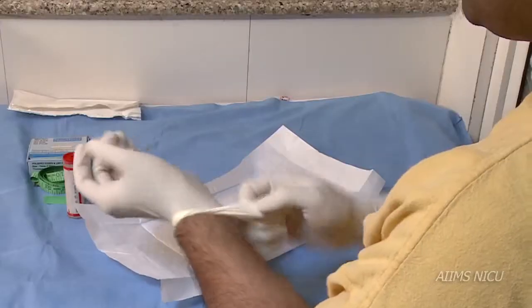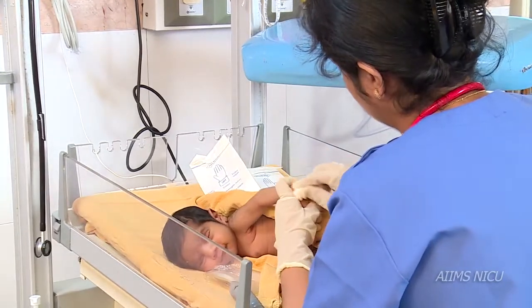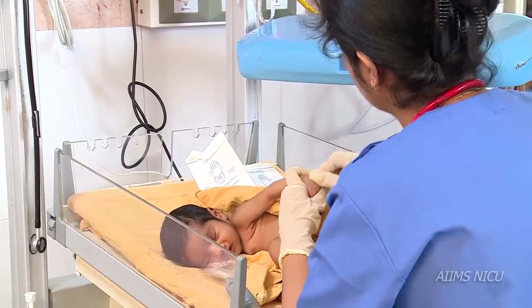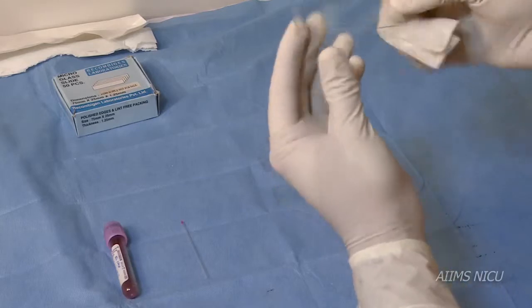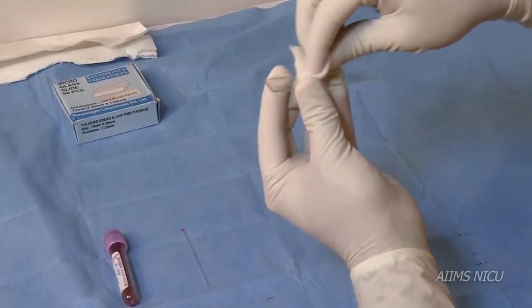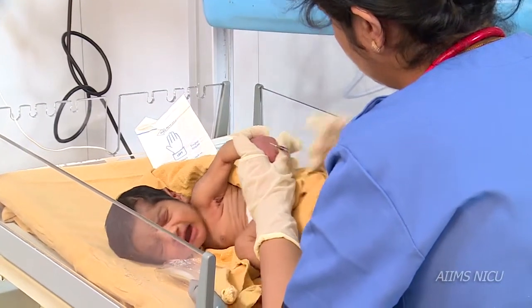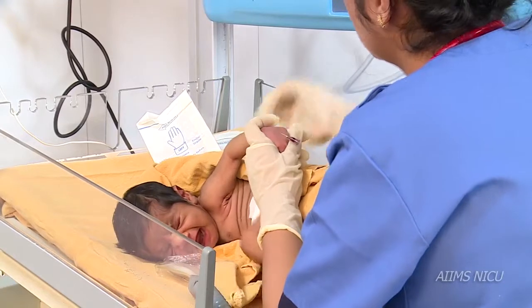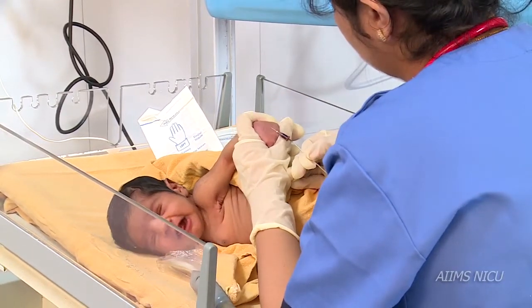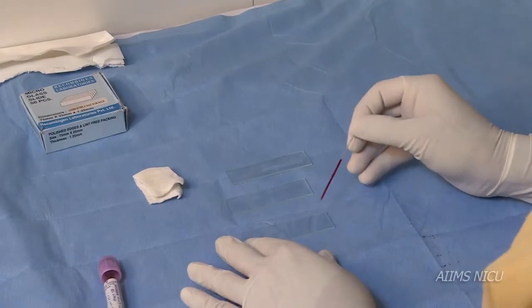In this video we shall learn how to prepare a good peripheral smear. Take a glass slide and clean it thoroughly using a plain gauze piece. Now draw a drop of blood sample by heel or finger prick, and put a drop of blood on one end of the glass slide.